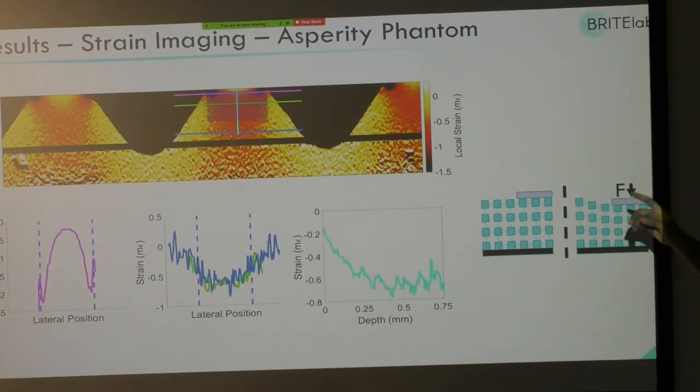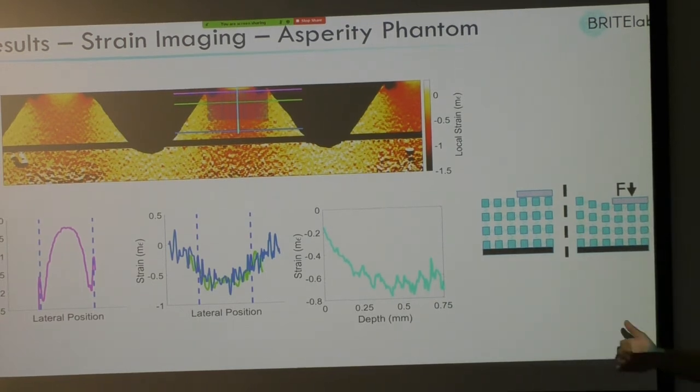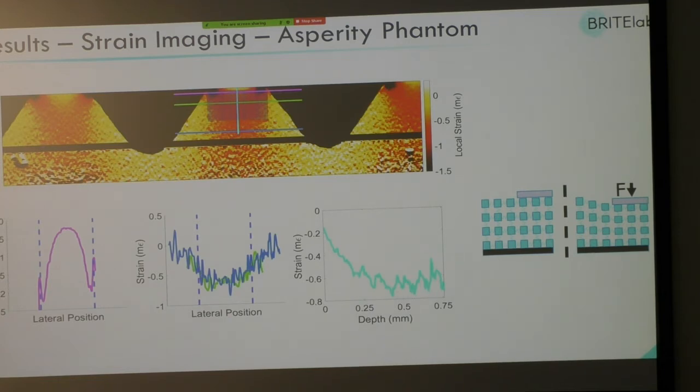If we take the blue and green scans, if we model the sample as a mass of springs and masses, you'd expect to see a concave up shape as we move along in measured strain. That's exactly what you see and it doesn't seem to vary too much as we get down in depth. So it looks like the assumption of equal displacement seems to hold at depth.